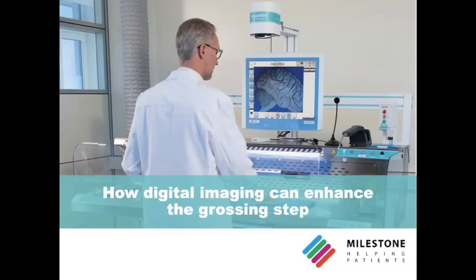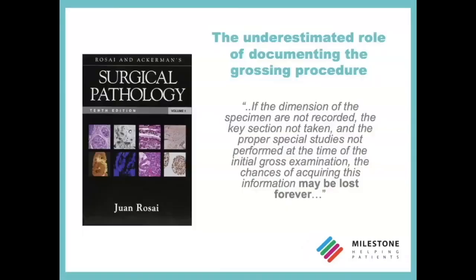This last one is still too often based on traditional and old description techniques. It is clear that there is an underestimation of the role of documenting the grossing procedure.